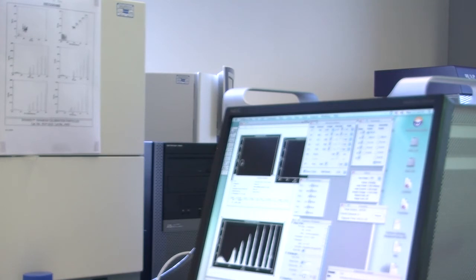Do you think we spin first, wash, and spin again? No, I would just spin once. So we add 1 milliliter. You add some extra because there's detergent, which really helps free any generally stuck stuff, and dilutes down that antibody, and then you spin it.